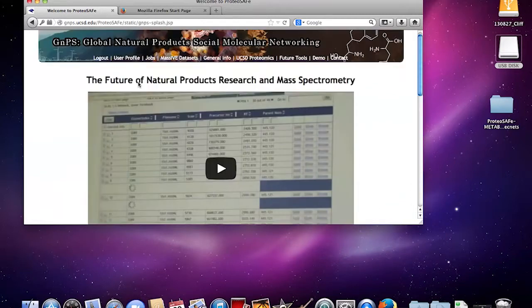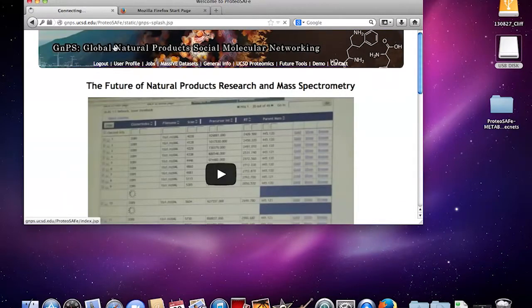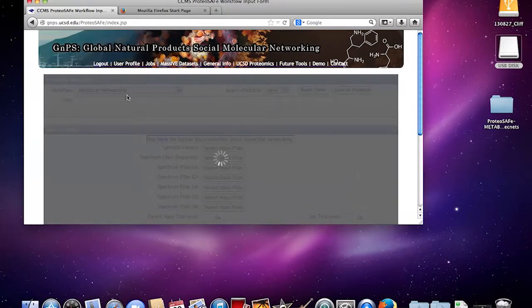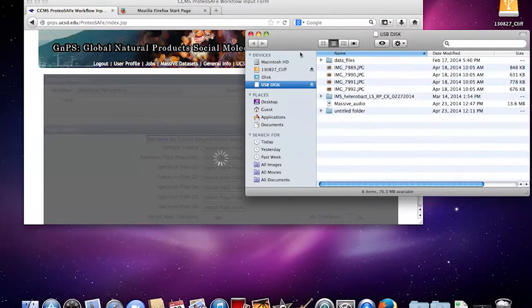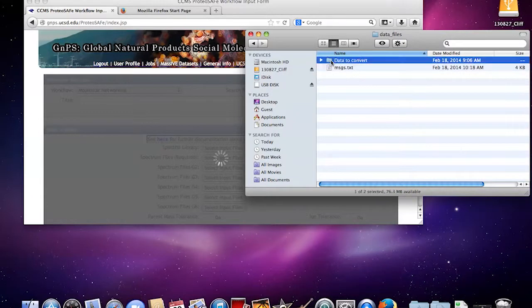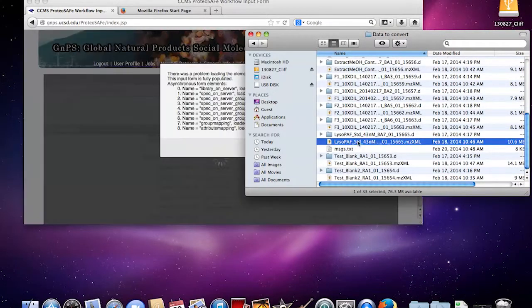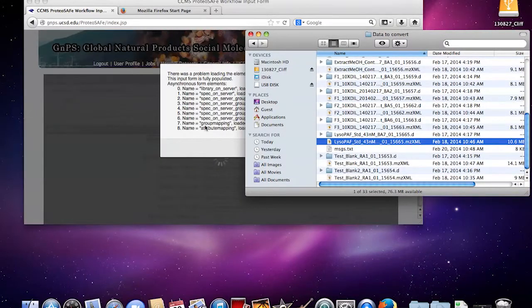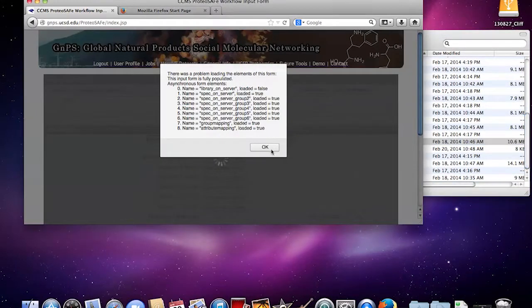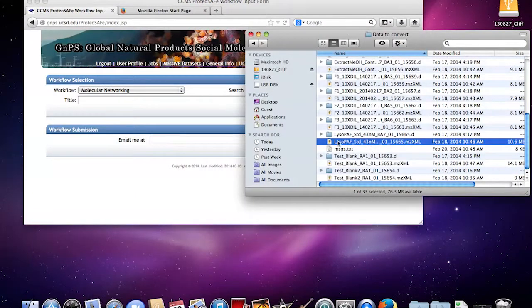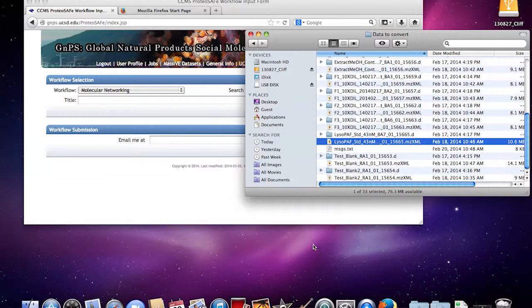What you're going to want to do is click on the banner. In this case what I want to do is I want to upload this spectrum, Lysopaf standard.